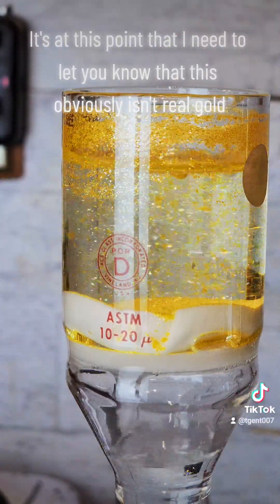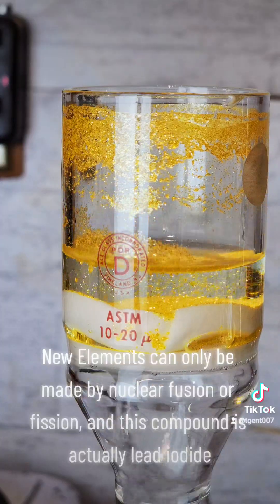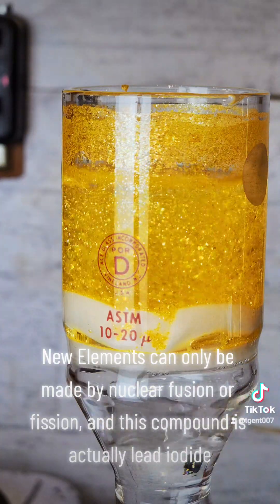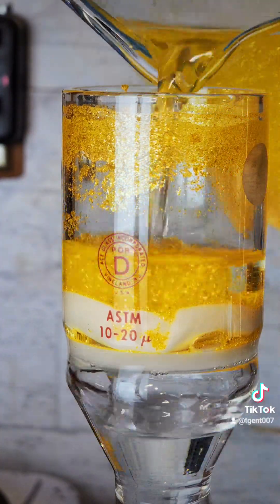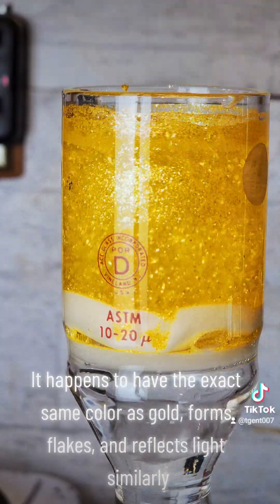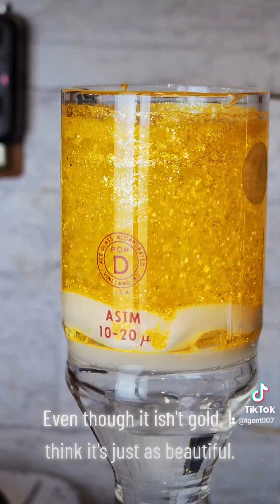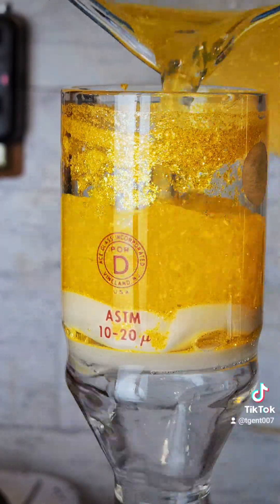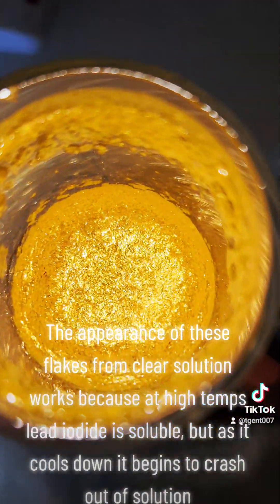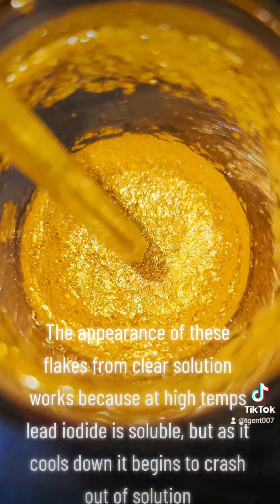It's at this point that I need to let you know that this obviously isn't real gold. New elements can only be made by nuclear fusion or fission, and this compound is actually lead iodide. It happens to have the exact same color as gold, forms flakes, and reflects light similarly. Even though it isn't gold, I think it's just as beautiful. The appearance of these flakes from clear solution works because at high temperatures lead iodide is soluble, but as it cools down it begins to crash out of solution.